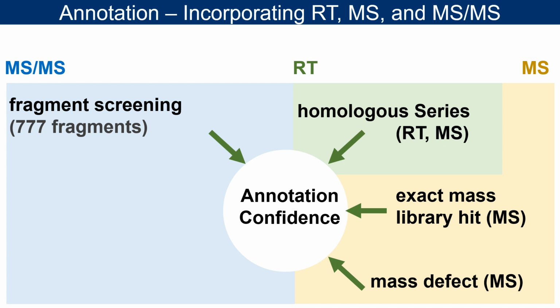And this is a truly non-targeted approach. So it will look for any of the masses in your fragmentation regardless of the precursor mass, and see if it can annotate, for example, a C2F5 on any of those masses. And if they have fluorines, then it gives you evidence that you may have a PFAS molecule based on the annotated fragmentation.